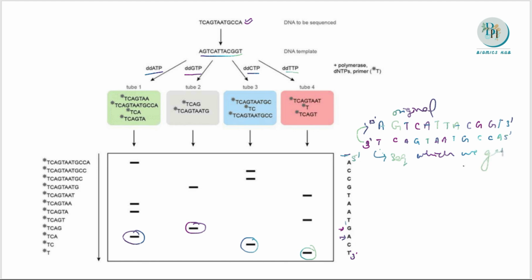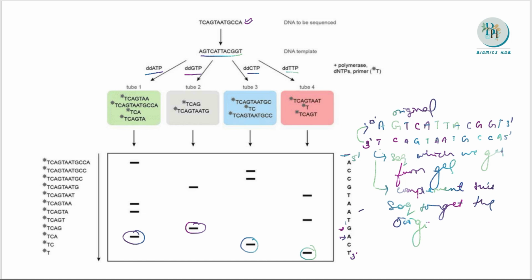If we complement this sequence, we get the original DNA sequence. This is how the sequencing is being done.